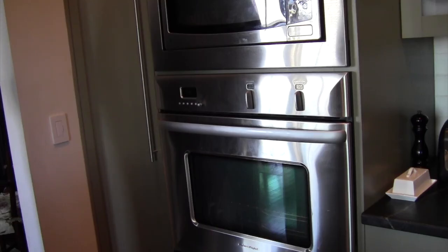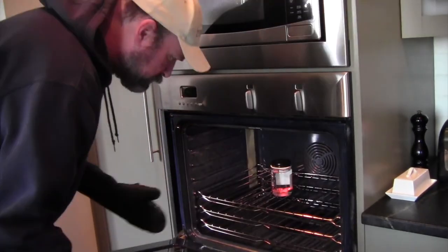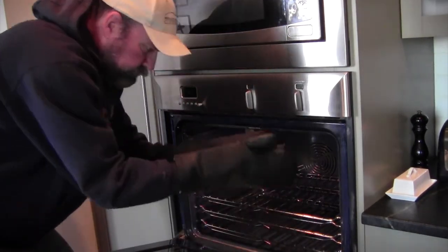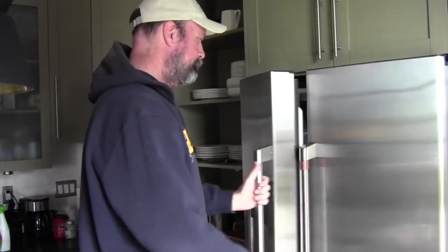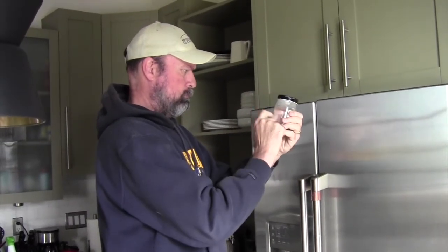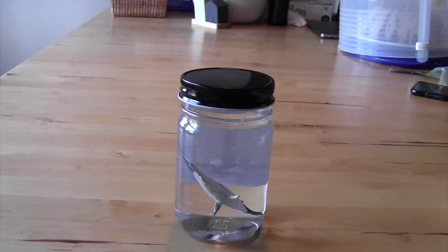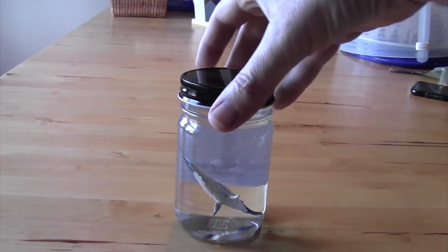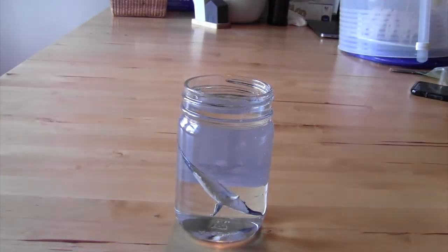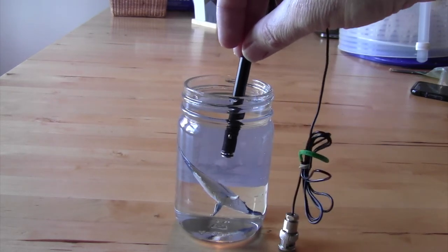Now that you know something about how metabolic rate is measured, we can go back to our own closed respirometry study. So we can retrieve our samples, first from the hot environment, and then from the cold environment. Oops. May have let that one go a little bit too long. Now that the fish had spent its allotted time respiring within the jar, we can make our final measurement, unseal the jar, get our oxygen probe once again, and measure the final oxygen content of the vial.